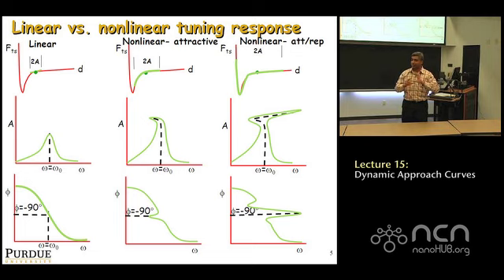Okay? So, the words attractive and repulsive in each case have a different meaning, and you have to be aware. Don't just think it's an attractive force, so it's in the attractive regime, so it's not touching the sample. It's not true. In tapping mode, it's just that the net interaction force is going to be negative. So as long as it's mostly an attractive force and a little repulsive force, that's also okay. Okay? So these are very subtle, important differences.